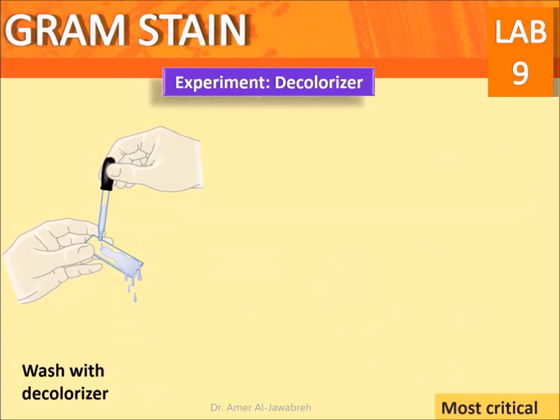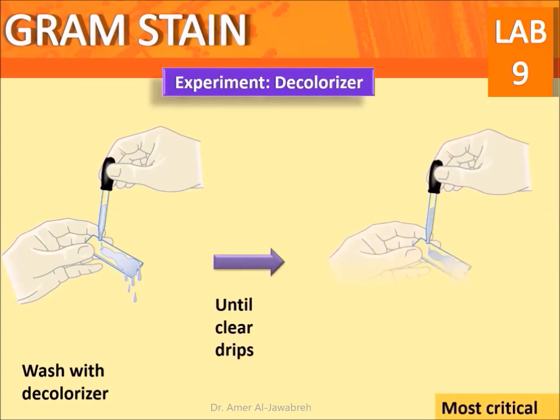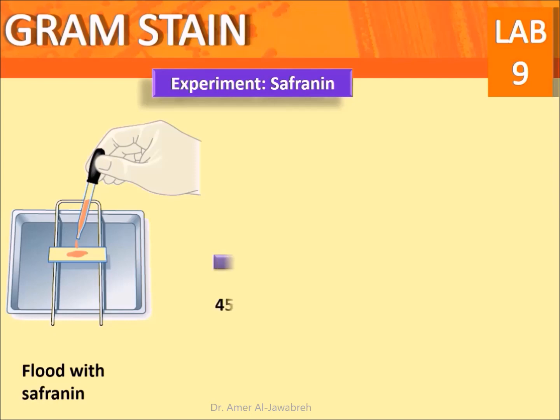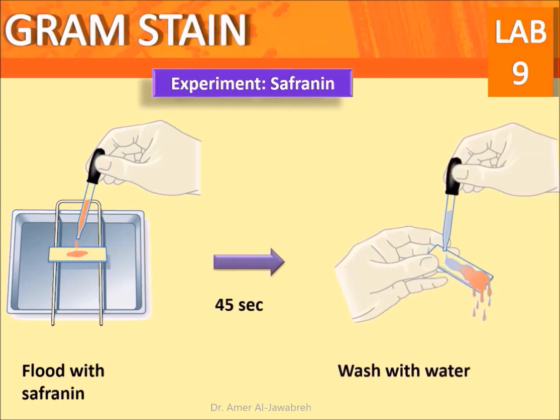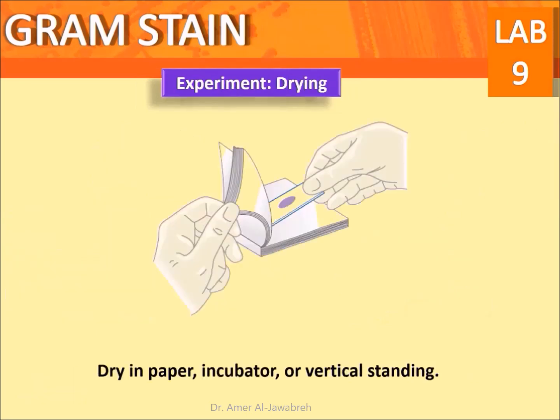Wash with decolorizer until clear drips appear, then wash with water. Flood with safranine and wait for 45 seconds. Wash with water, then dry using paper, an incubator, or by vertical standing.